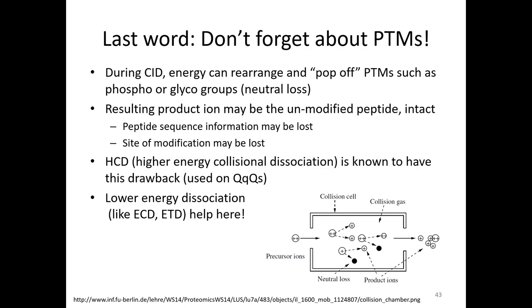They do make synthetic phosphopeptides, or I'm sure you could get glycosylated ones, but you would want to make sure that everything co-elutes properly, because if you do the fragmentation, that side group may pop off and you won't be able to tell exactly where it is. So without an exact replicate heavy labeled internal standard, it will be difficult to know for sure what you're monitoring.